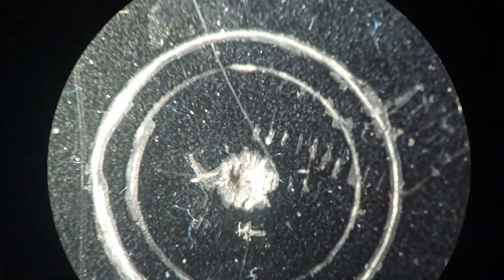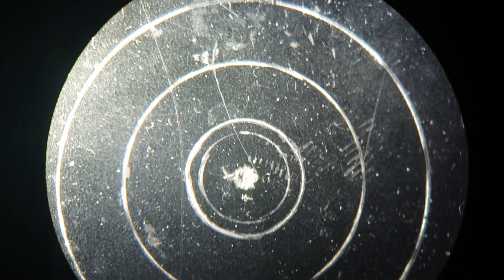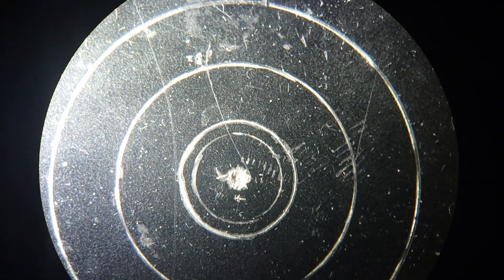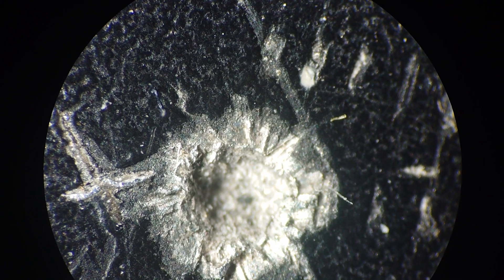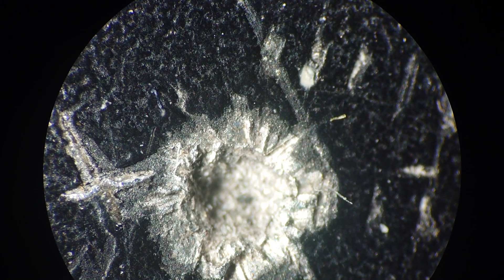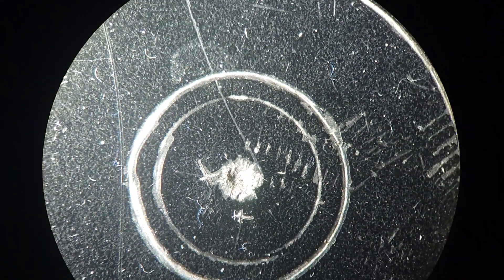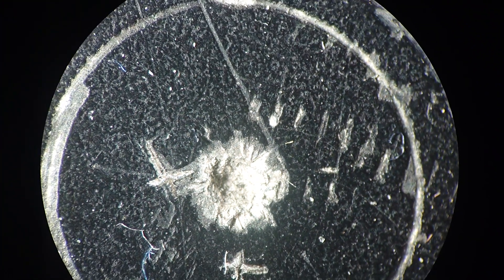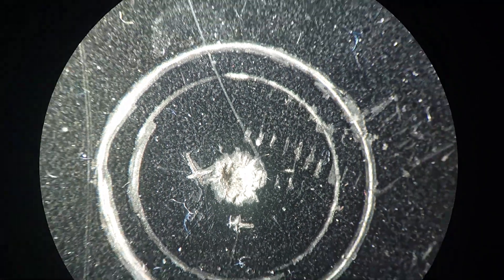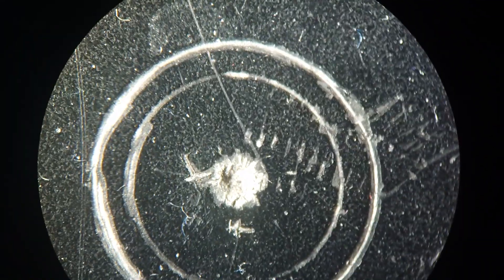I don't see that streak again — it was there but it's gone. However, when I adjust the zoom you can see the entire frame shifts to the left bottom corner, around the seven o'clock position. That's the main issue — aside from a very fast strike or flash when I change zoom, which I can't reproduce right now.